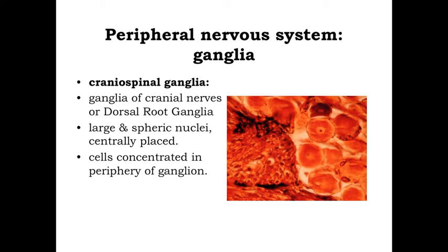Looking at the cranial spinal ganglia, like the dorsal root ganglia, the cells are going to be relatively large and rounder in appearance. We're going to have large spherical nuclei, again euchromatic with a lighter staining appearance, and a distinct nucleolus — indicating a cell involved with a lot of protein synthesis. The cytoplasm shows that Nissl body granular basophilic staining because of all the ribosomes present. In a dorsal root ganglia, the sensory neurons tend to be concentrated at the periphery, and you can see clusters of nerves with the axon surrounded by a paler staining ring visible at higher magnification with specialized stains.